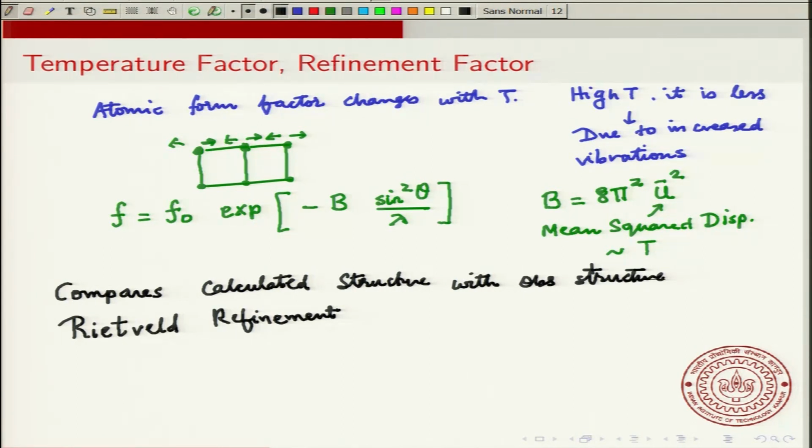This is named after the scientist Hugo Rietveld. Okay. So, the idea is that you compare the structure factor that you observe with some model calculated structure factor.